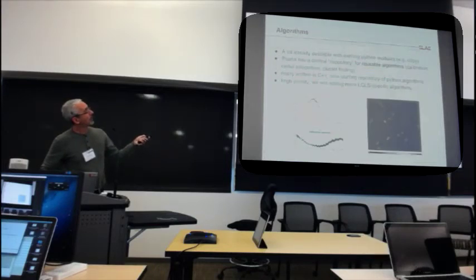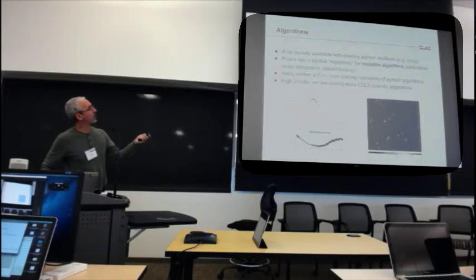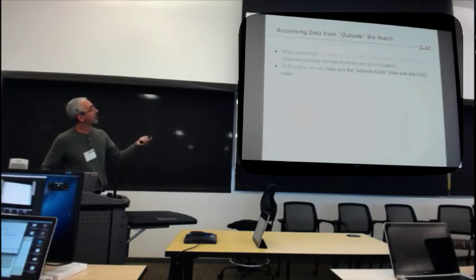Algorithms. There's a lot available in the Python modules. With SciPy, we don't have crystallography stuff. I don't think we ever will. That's too specialized for Psana. We're trying to be more of a general tool. But it's nice that CCTBX sort of built their stuff on top of Psana, I think. You can use lots of stuff in SciPy, but we do have a central repository of reusable algorithms, like calibrations, radial integrations, cluster finding. Many are written in C++. We're now starting to do Python, and this is a high priority for us to add more algorithms.